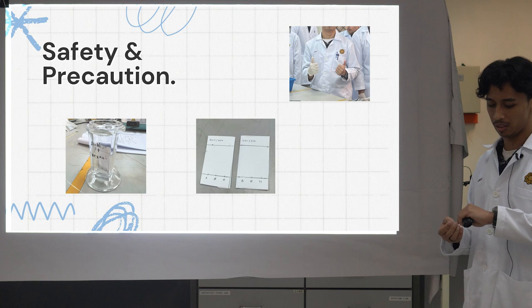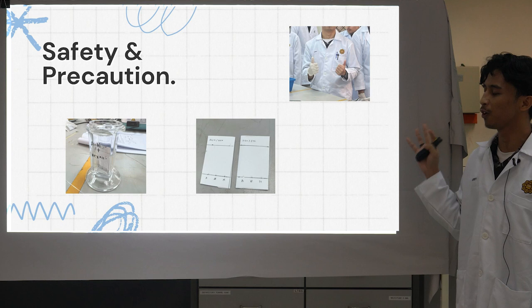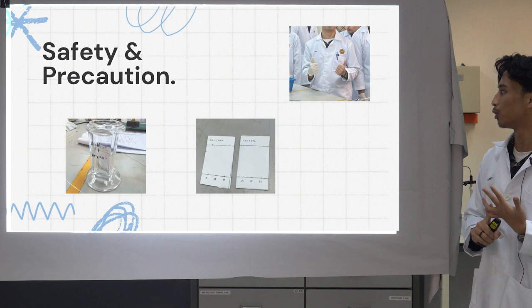And also we need to wear gloves to protect our hands from the chemicals. And also for the TLC plate, we cannot touch it with our bare hands. So that's why we need to wear gloves.